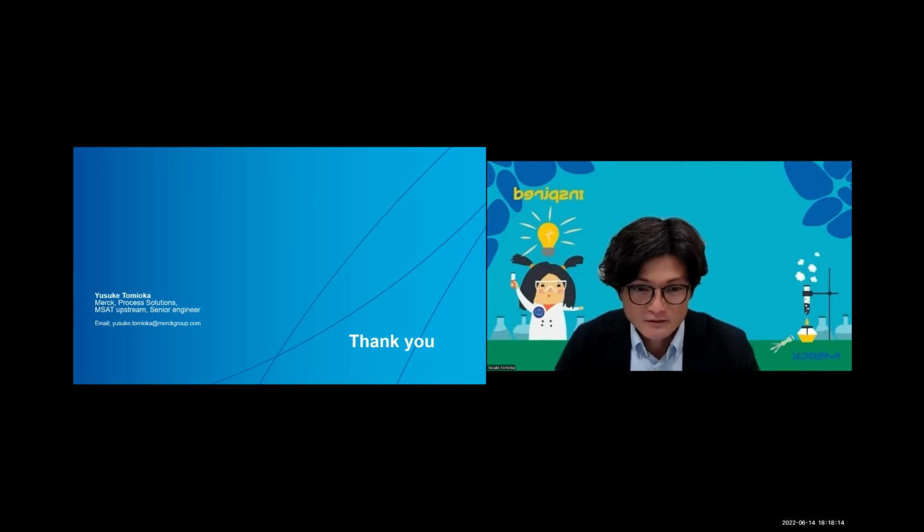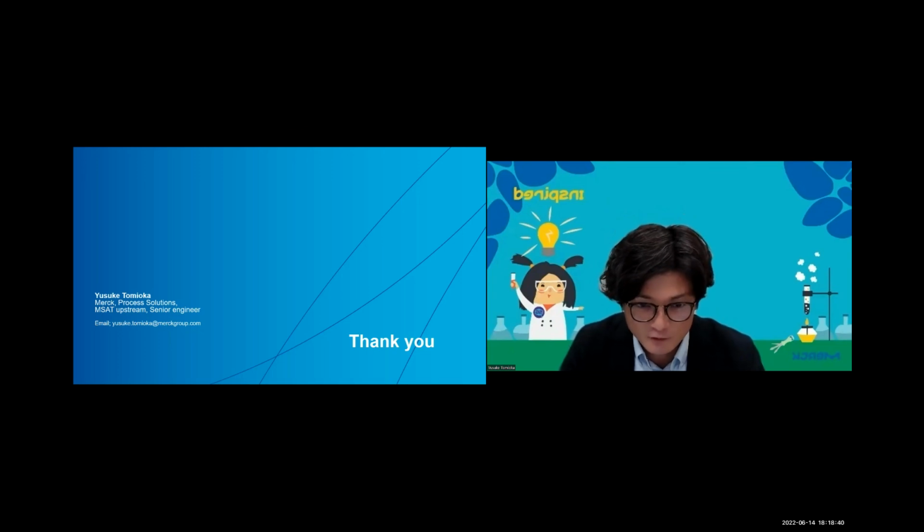Then from the remaining data set, we make a chemometric model, and after that, compare it to the data set that was removed. So this is the cross validation. This cross-validation evaluation is automatically supported by this software.